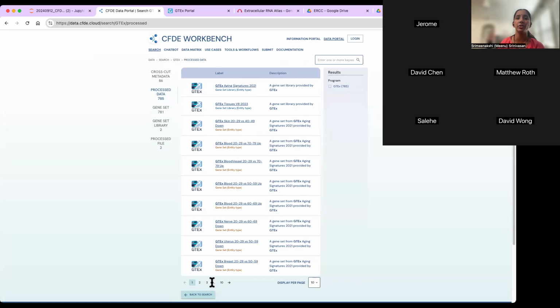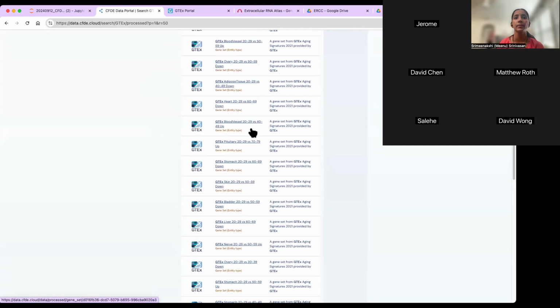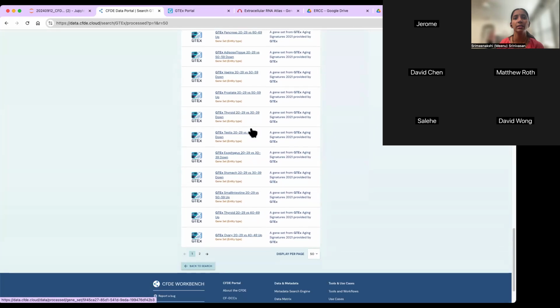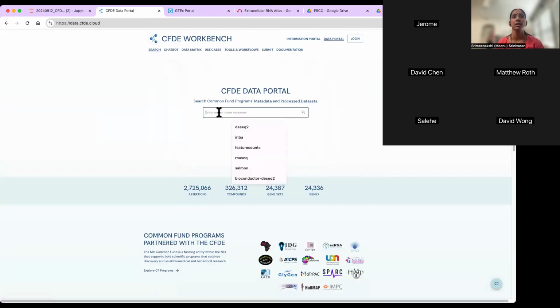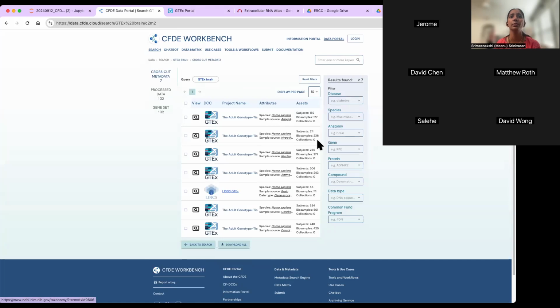I think if I searched for brain, I might get it. Let's search GTEx brain. Yeah, so here you do have analysis. It's already been done, so you might be able to look at the analysis from here.